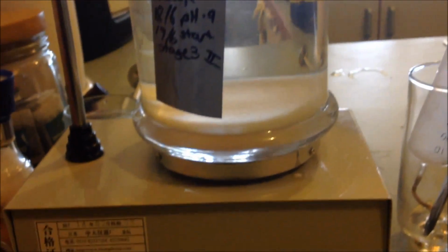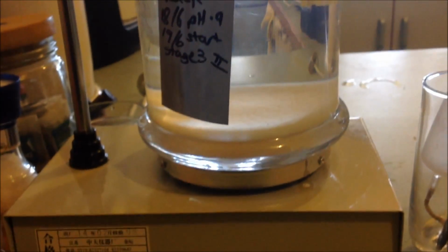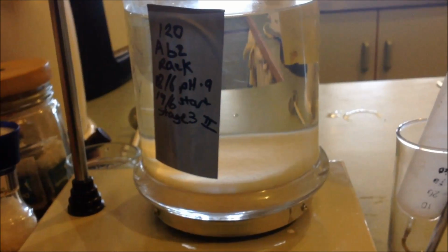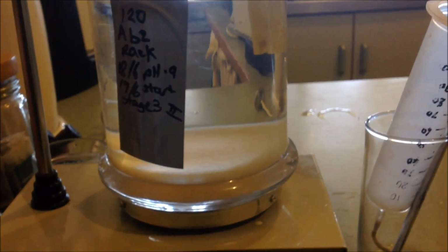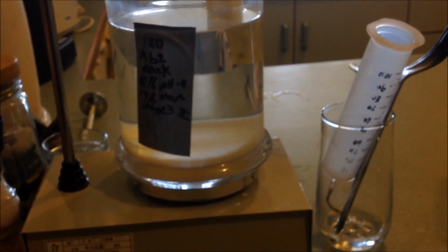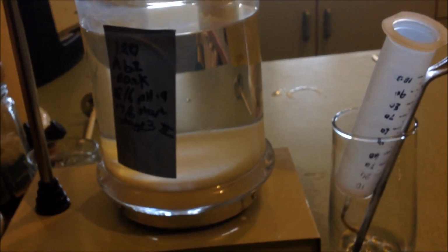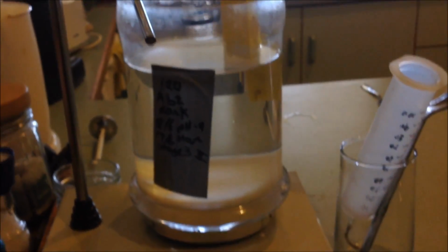So the way to do this is to rack this off. Now it's the precipitate that we want. We'll rack it off, add some more water, 500 ml say, and add acid again, hydrochloric acid, pH down to 1, dissolve it, and redo it again another few weeks, and hopefully when it's running towards the end, be a bit more careful.